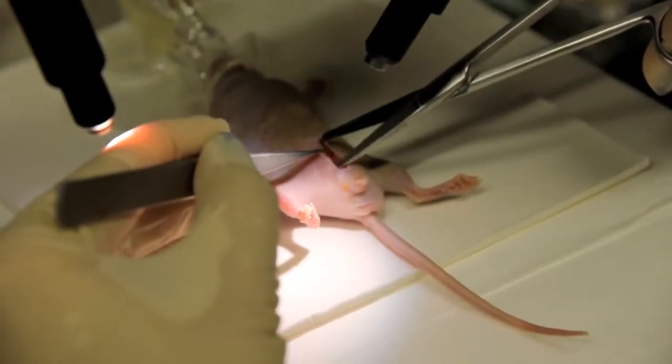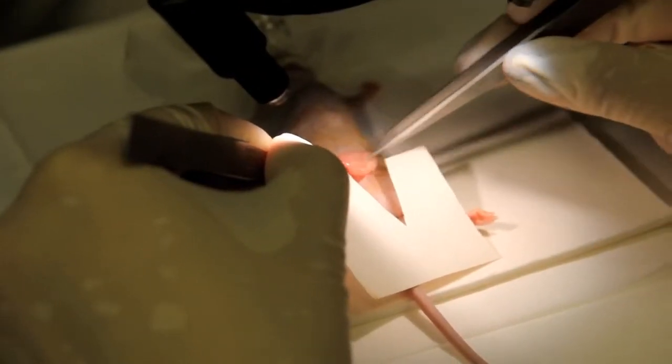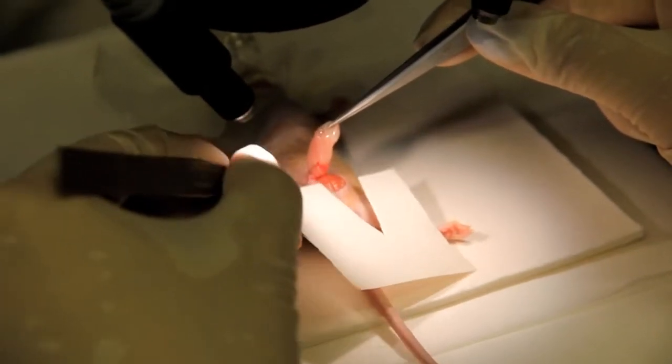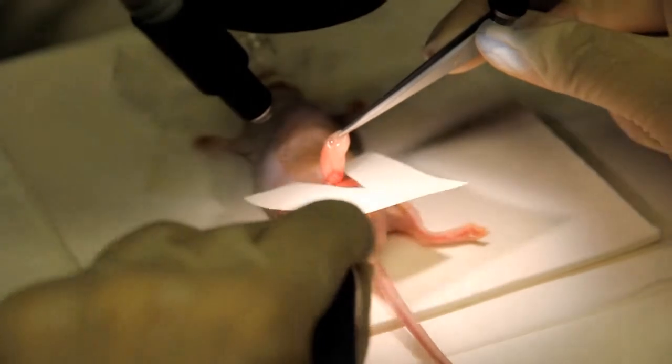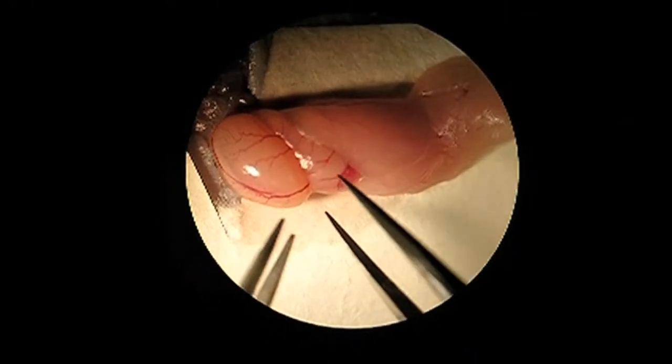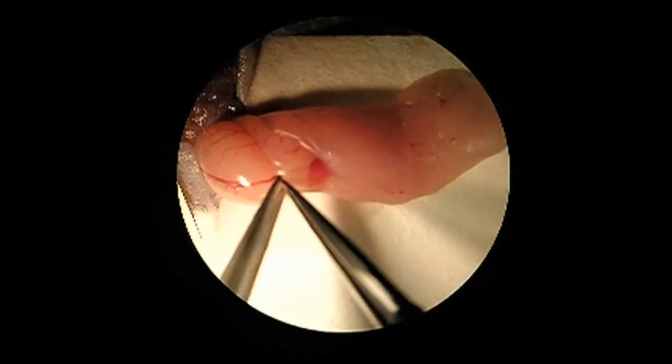Clean the abdominal area with betadine before starting the surgery. Perform a 1 cm length incision on the linea alba. Retrieve the first testis carefully by pulling out from the fat pad surrounding the epididymis. After this, use sterile V-cut paper pads to deposit the gonad.